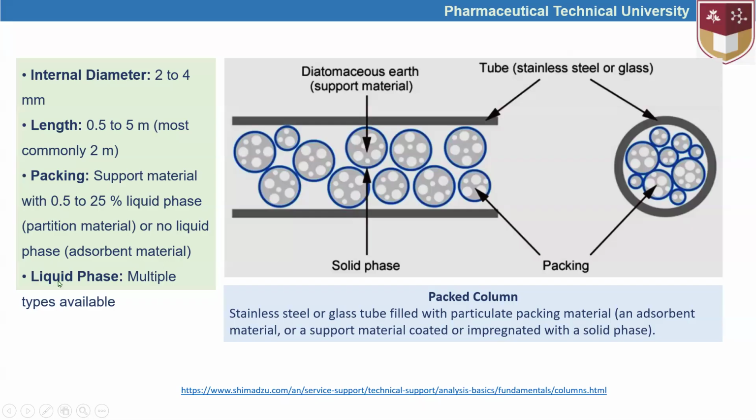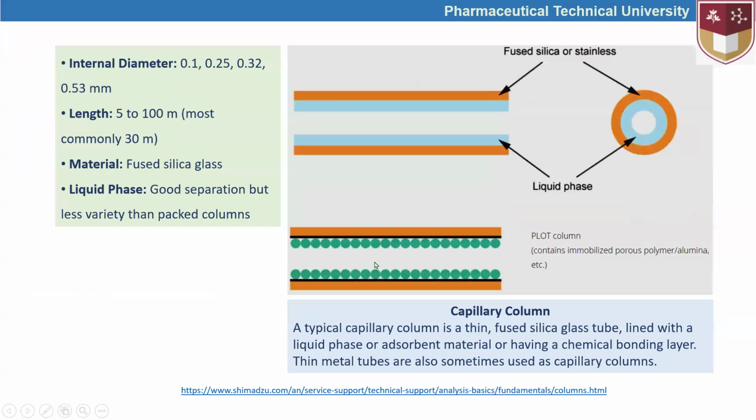Yeah, and the liquid phase can be of multiple types available. So there could be columns filled with liquid, or columns without the liquid.